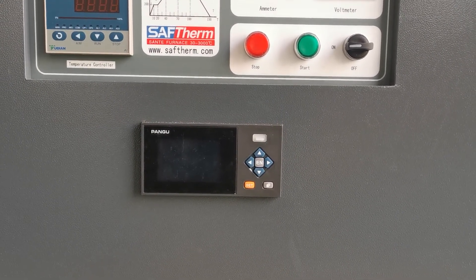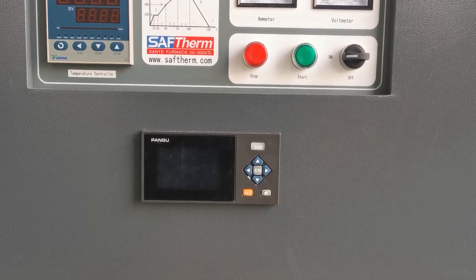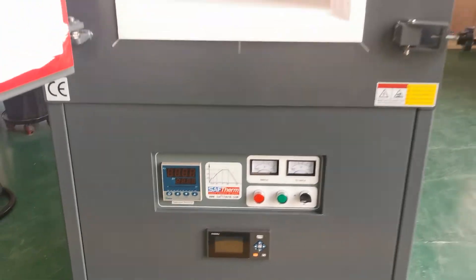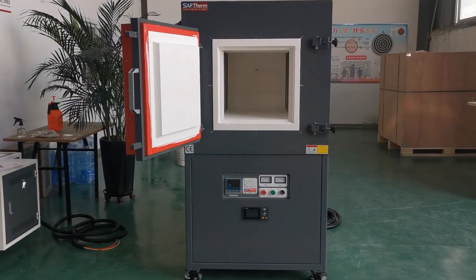It can be used to edit a heating curve during heating. Thanks for your time. Thank you.